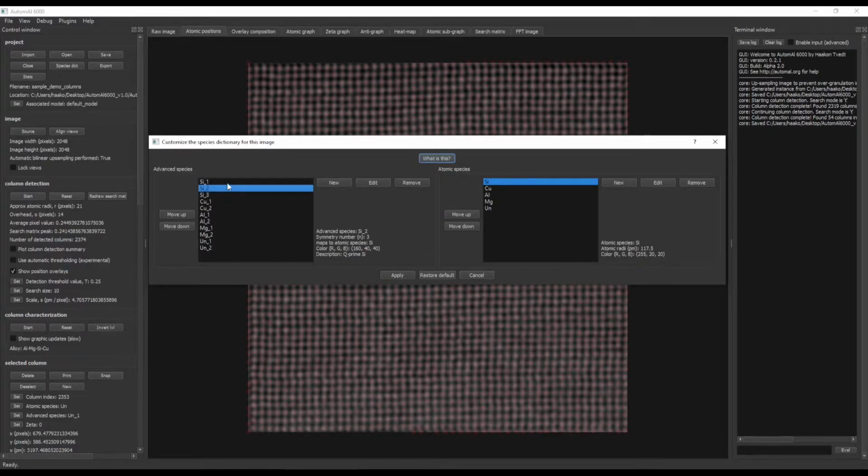So for the method to work, a part of the method uses a statistical model. So this subdivision helps in that. And so which categories you want present depends on what is in the image. If you are looking at a Q prime or beta double prime or disordered, or what do you expect to find.